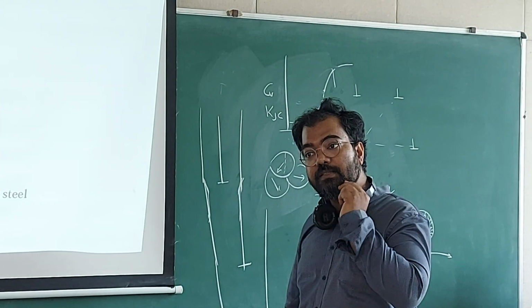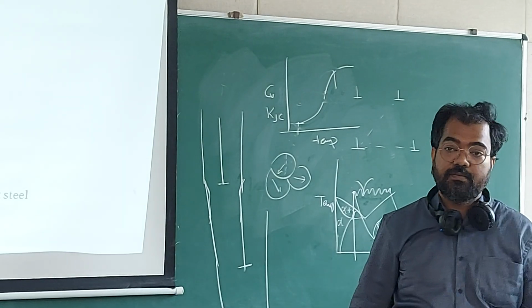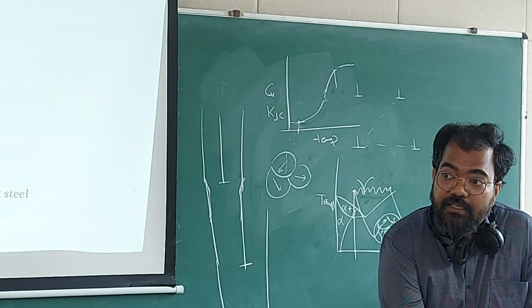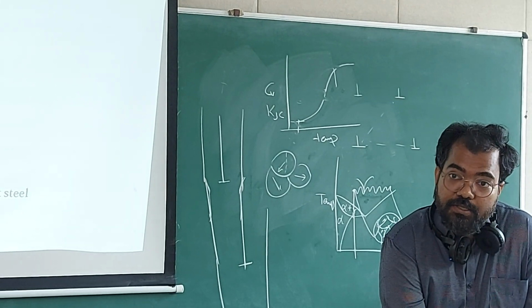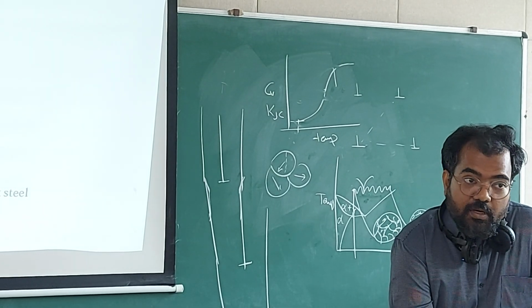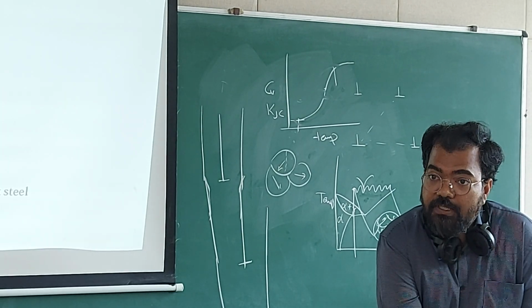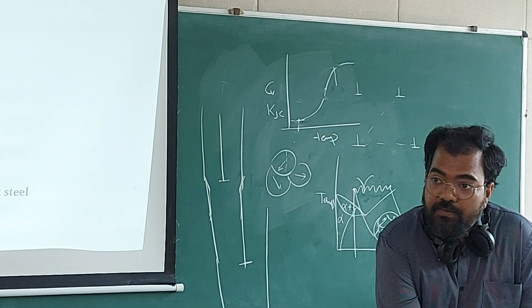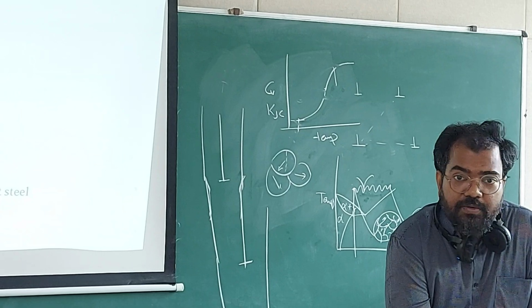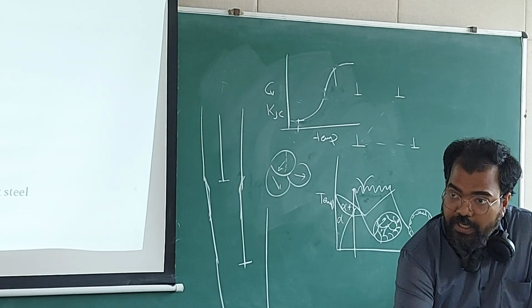For fatigue fracture, the signature is that the crack will develop from the surface, always. So when you do testing of that, the mandatory thing is that your sample must be mirror polished. You should not have a lot of surface roughness, because that will create error. Depending upon how much surface roughness you have, a fatigue crack will initiate at an early stage for different samples. So you need to polish it to the same level as others are doing.